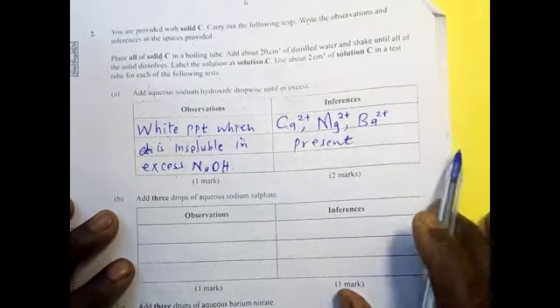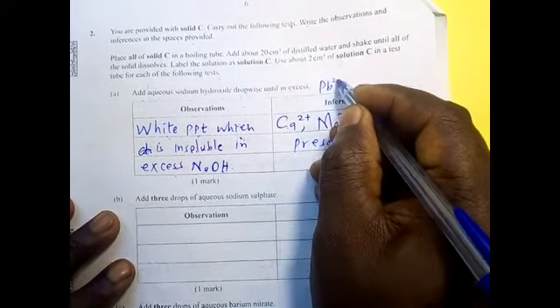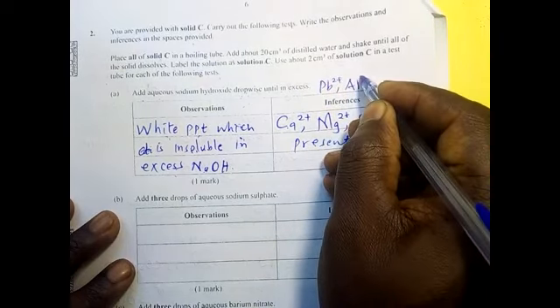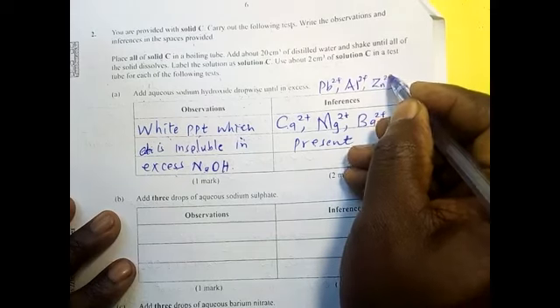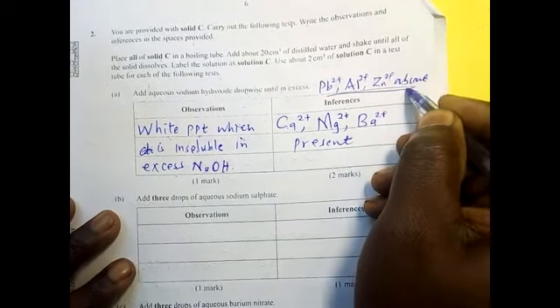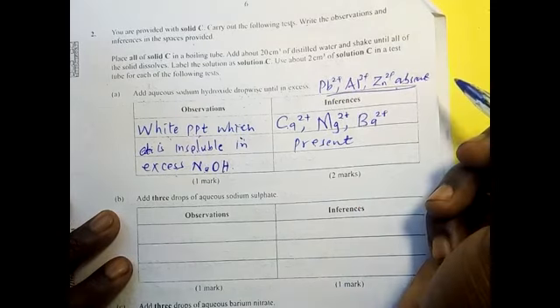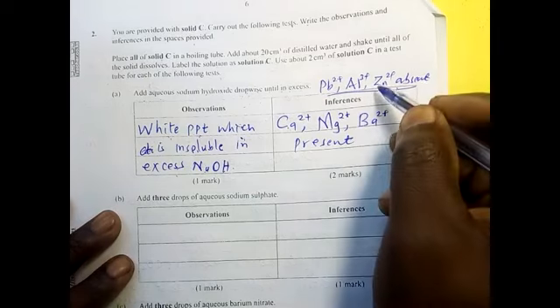Now you can ask me, is it correct for you to write that lead 2+, aluminium 3+, and zinc 2+ are absent? It is correct, but unacceptable. It is correct, but nowadays they don't accept that.